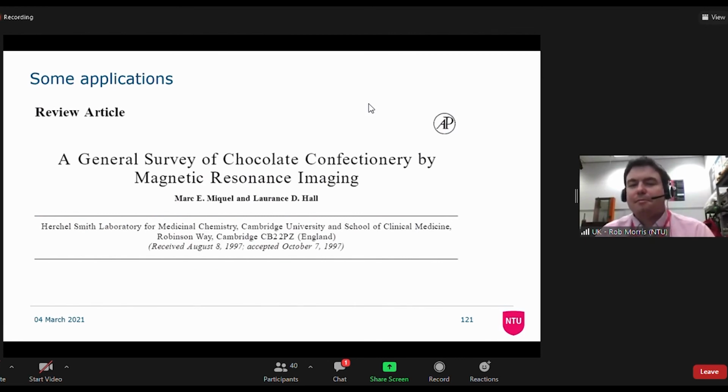So we've had a couple of projects in the past where we've done recipe development. And it's really good for recipe development because instead of having to put in 1,000 samples one at a time into your time domain instrument, you can put 1,000 samples all in the scanner at once and hit go, and it will just step through them. There's a load of data and it's painful to analyze, but you only have to do the experiment once and you just collect everything all in one go.